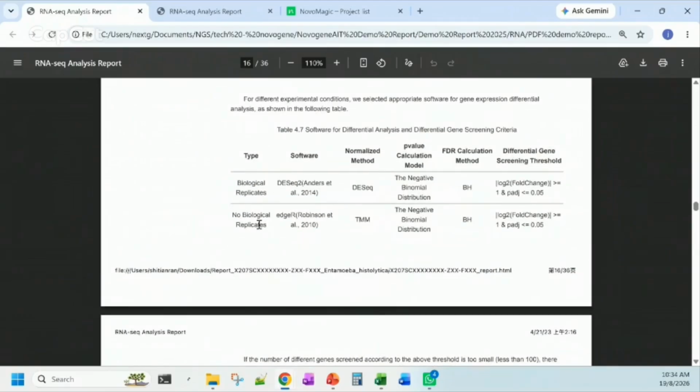And then depending on different experiments or software used, they might involve different normalization methods. Normally the differential expression cutoff will be set by default to log two-fold change more than 1 or less than -1. This shows the differences between the changes, how many folds different they are, and then how statistically significant they are. Normally we use an adjusted p-value less than 0.05.